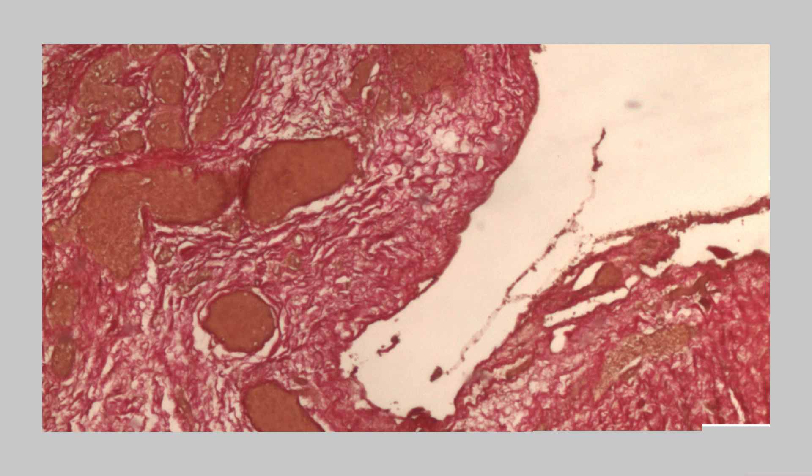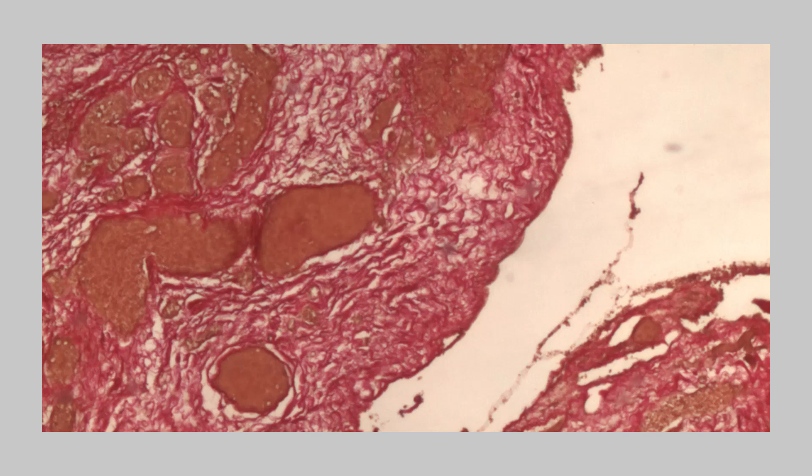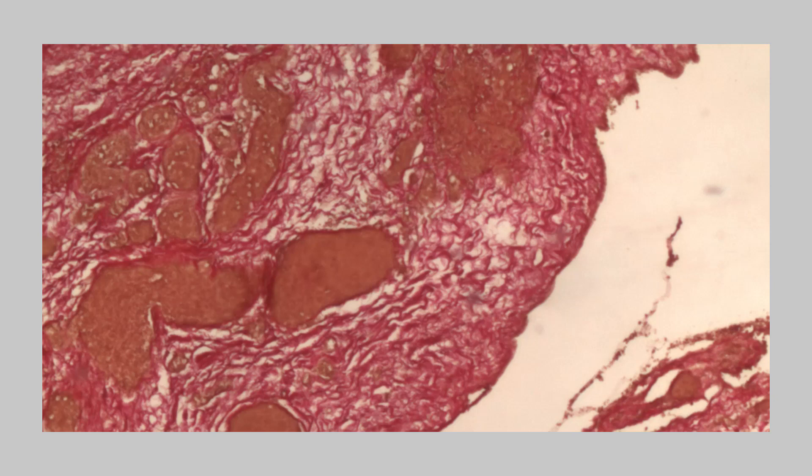Collagen is red and all other structures are yellow. The application of this method is important for studying pathological changes in bones, tendons, cartilages, skin, and blood vessels.